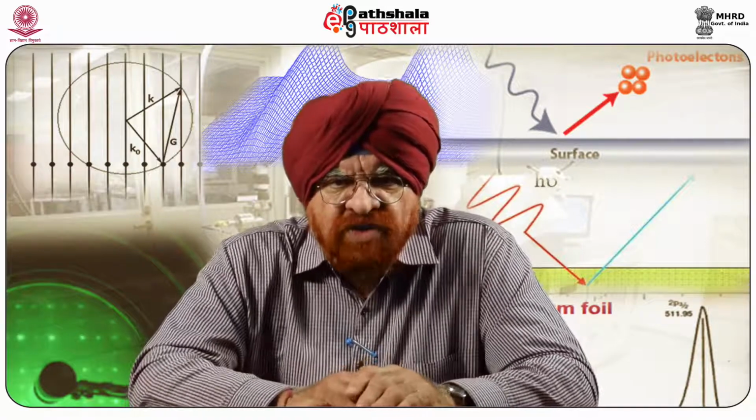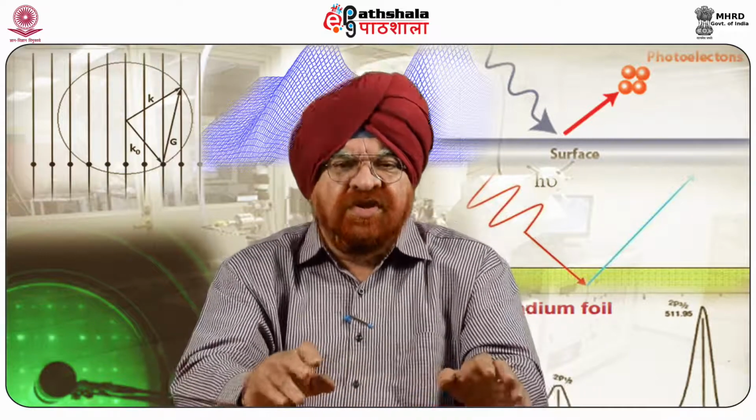Compared with the scanning electron microscope, SEM, the AFM provides extraordinary topographic contrast, direct height measurements, and an unobscured view of the surface features. No coating is necessary while using this.